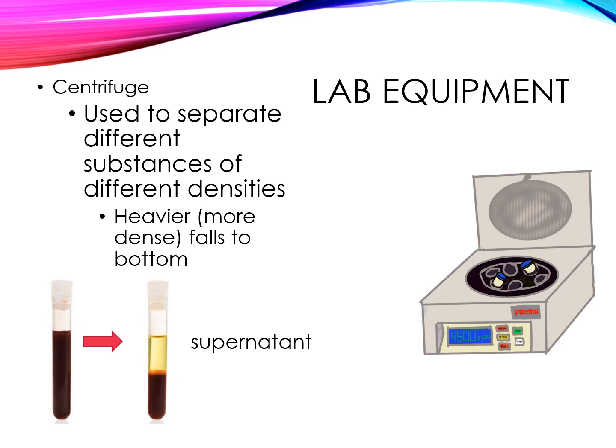The most important thing to remember with the centrifuge is that it is balanced. If it is not balanced, it may walk off the table. So you always want to remember that you have 2 tubes, or wherever you have something, exactly opposite it with approximately the same amount of substance or liquid in it.